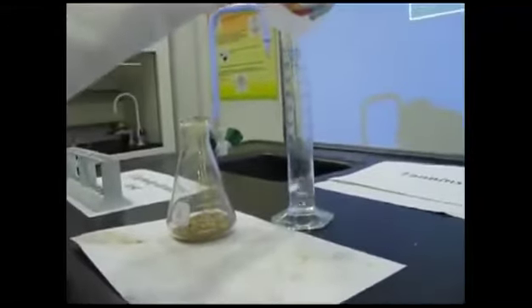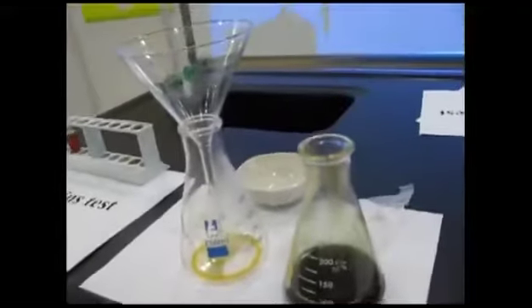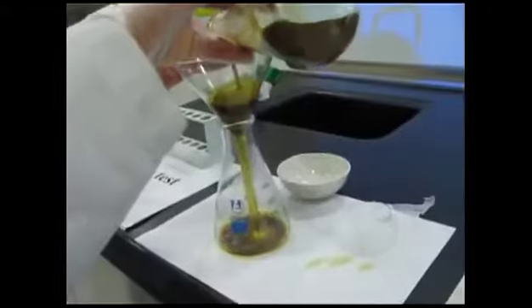Now we will be preparing the alcoholic extract from the sample that was taken into the flask. To that flask we are adding about 80 ml alcohol. Then we are going to cover it, and we will take a rest time of 30 minutes for completion of the extraction process. After extraction, we will filter the extract using the cotton filter again.